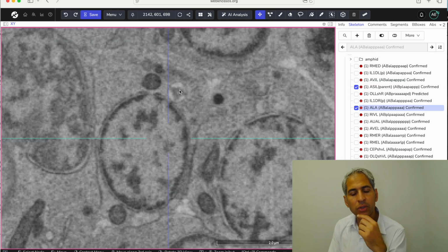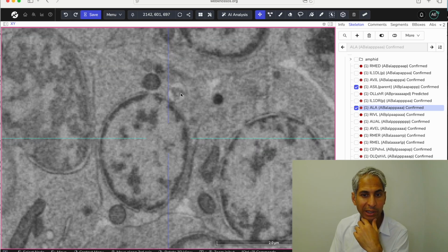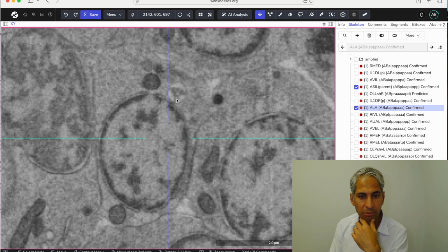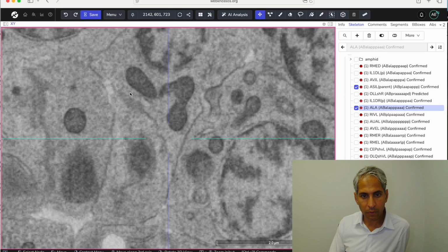Oh, look at this. Some kind of pearl that may be membrane bound. I see something resembling perhaps darkness at the periphery, but look how clear it is. This does not scream mitochondria to me. I'm not going to consider it mitochondria. This I would consider part of a mitochondria that then sort of jumps here.